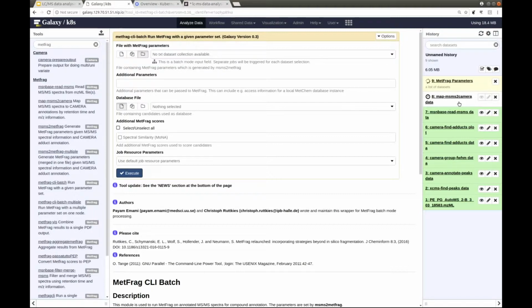And I think I remember that the reason it takes quite a while is because it's downloading the container with the tool still from our repository. And that can take a while because it is a few gigabytes in size. So if this doesn't turn green in the next seconds, I could go back to the presentation and we'll finish up the online demo in a minute or two.